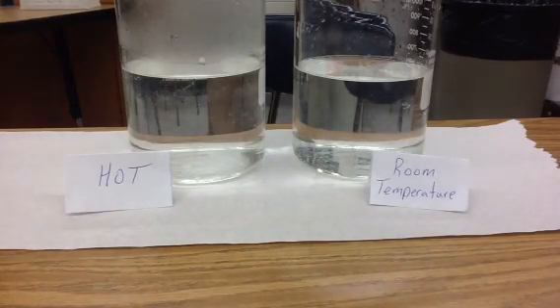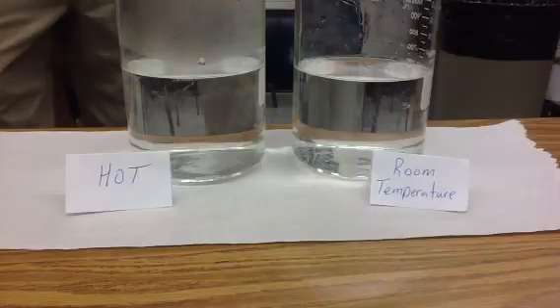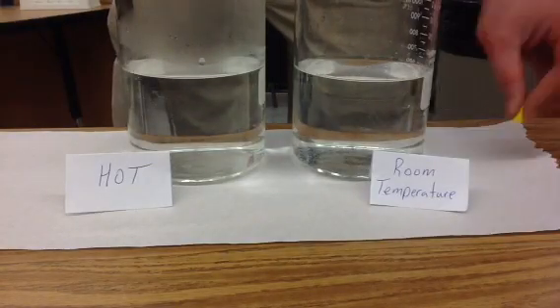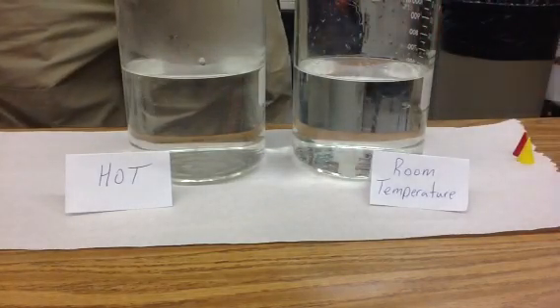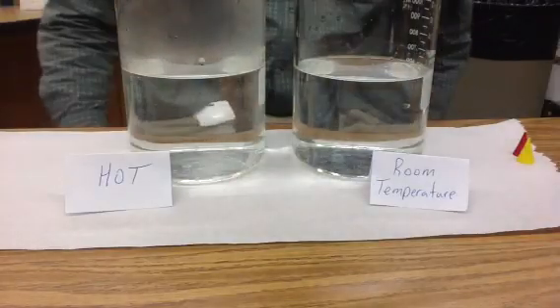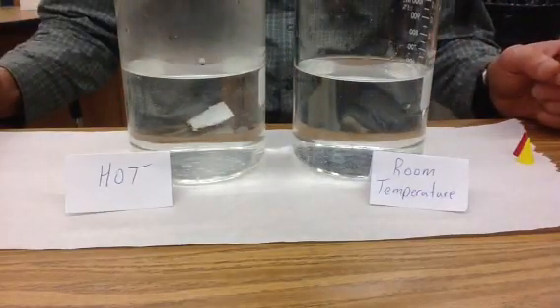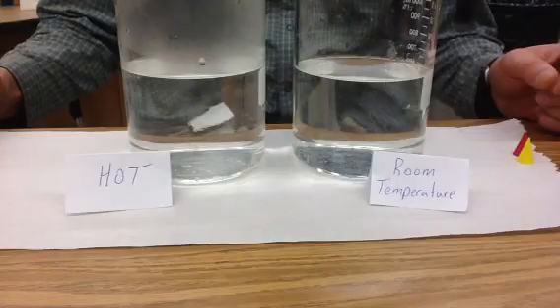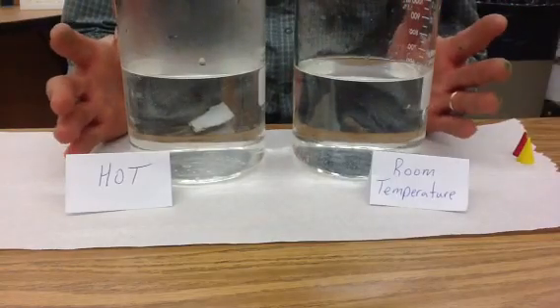We're going to do a little demo on diffusion, because the objectives we're working on are understanding diffusion and understanding concentration gradient. We have two beakers of water.